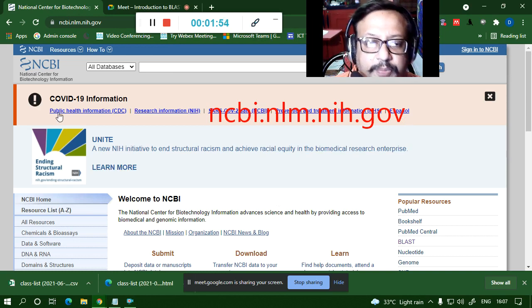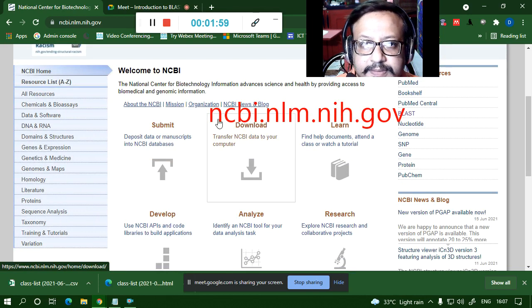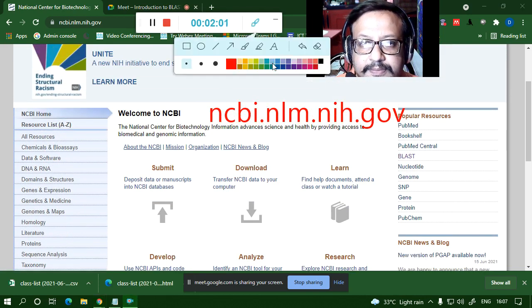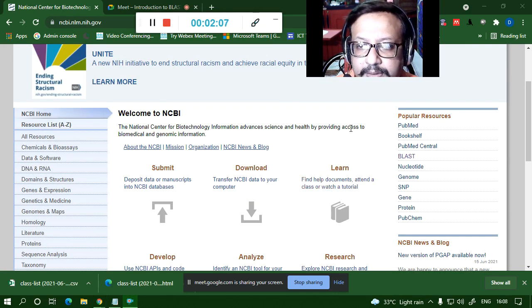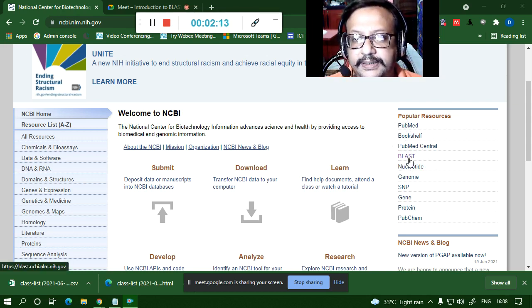Okay, once you open this particular website, you go to the right hand corner. There you will find BLAST.